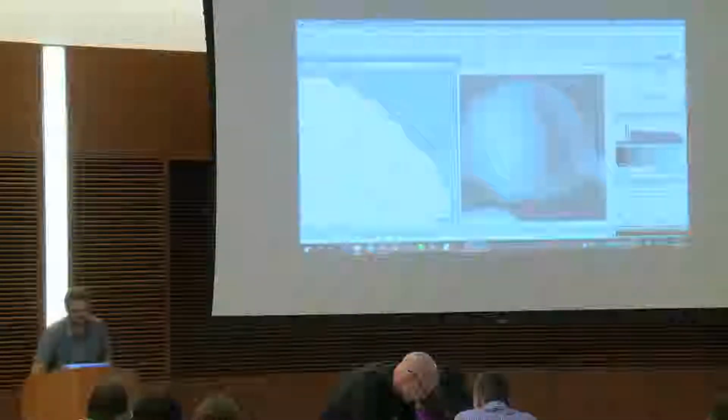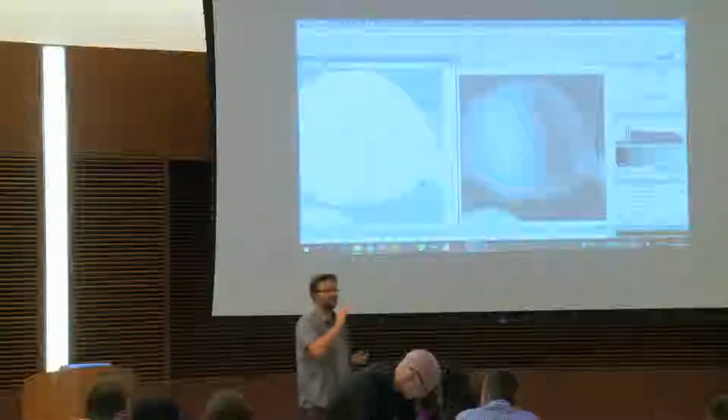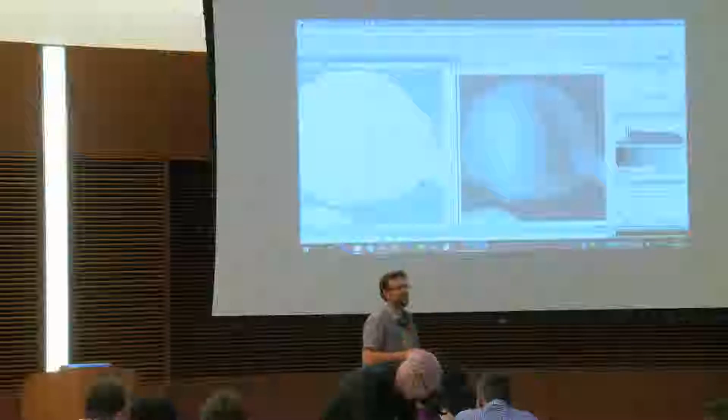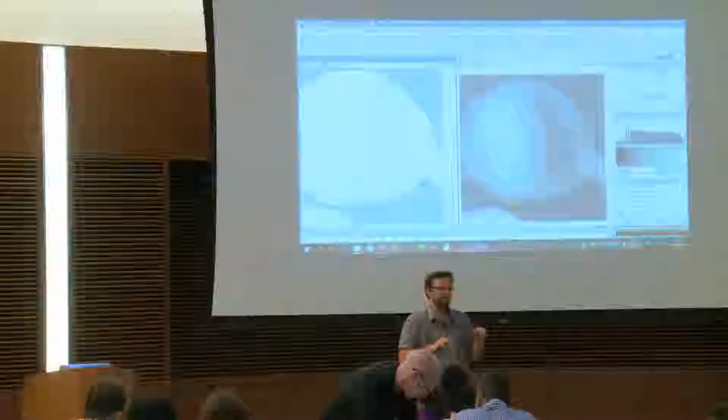Okay, so we can see also some dust, and in fact, if we plot the profile of this, we can also see that the plate is bending like this. Okay, so this is just a little bit of things. We didn't process anything since then, and if you were using a rolling ball or something to remove the background, you would have missed it, and that would be a problem.